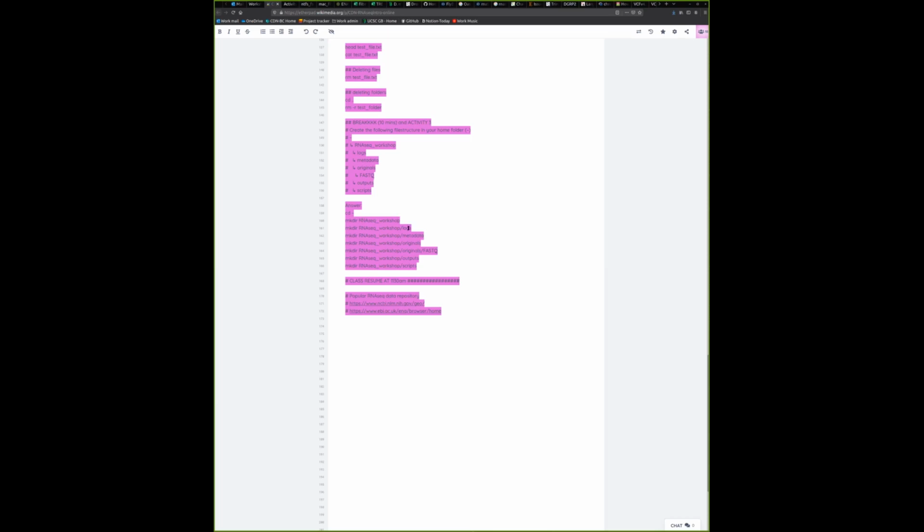And then within it, have a folder called log to log all your operations, like what functions you run, what scripts you run, and metadata containing a list of the files or the RNA-seq data, like what the data are and where they're coming from.